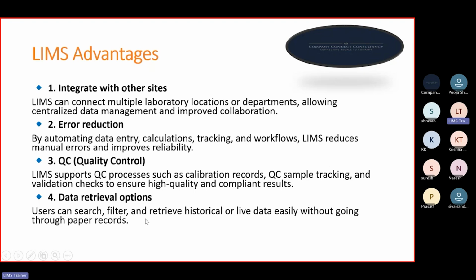Data retrieval options. Users can search, filter, and retrieve historical or live data easily without going through paper records, right? I think all of you or most of you may have undergone a USFDA audit or any other audits that happen in the laboratory. If you don't have any software implemented in your laboratory, the QA personnel need to run here and there to find the document, right? So they create a war room, they gather all the documents there, and if the auditor asks for one document, they just run and search for it.